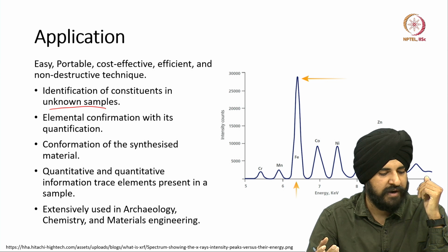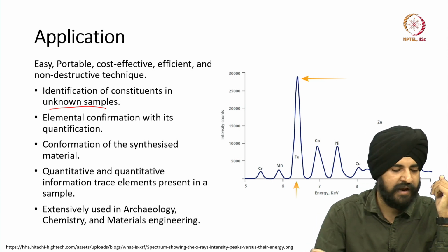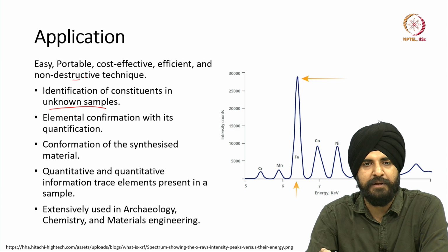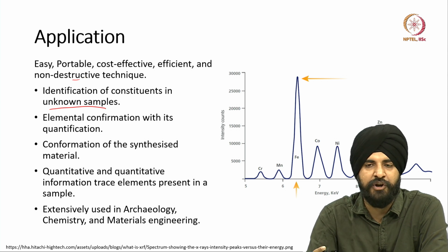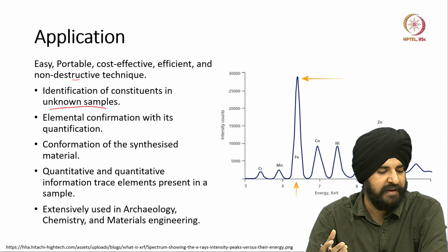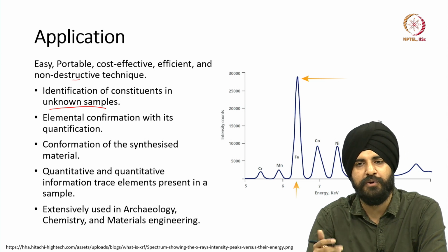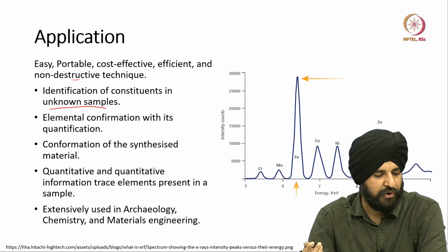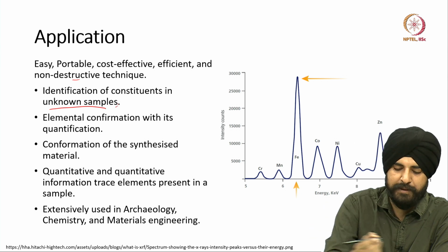It is easy, portable and non-destructive as well. You can use it for powder samples, liquid samples and any kind of samples. XRF is really easy to use and non-destructive, so you can utilize your sample again and again for different kinds of characterization. So, talking about the advantages, it gives us the identification of unknown samples.